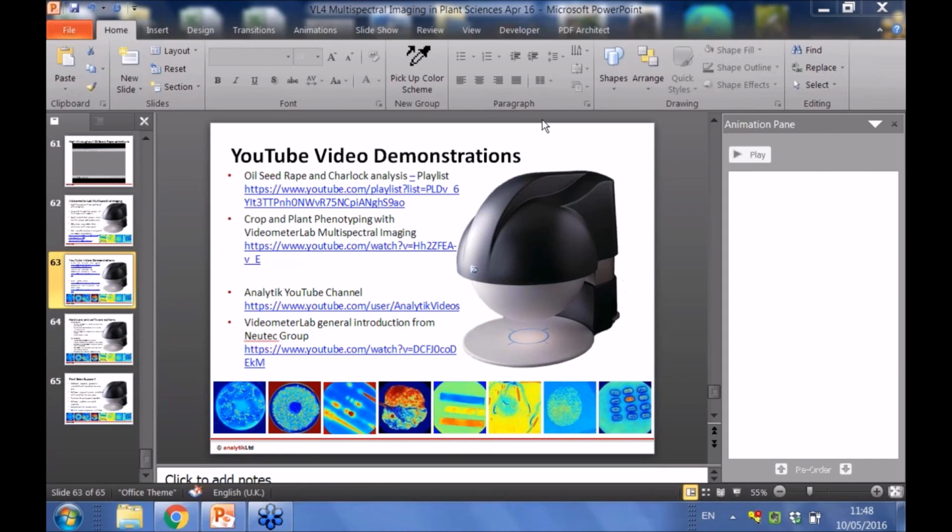I will mention a slightly separate technique that we have, which is Raman spectroscopy for 96 well plates. We have an instrument from DigiLab where you can put in a 96 well plate and it will give you Raman spectra for each well. Perhaps it's worth us having a chat later, Oliver. I'm going to talk a bit more about what you'd want to image in these plates.